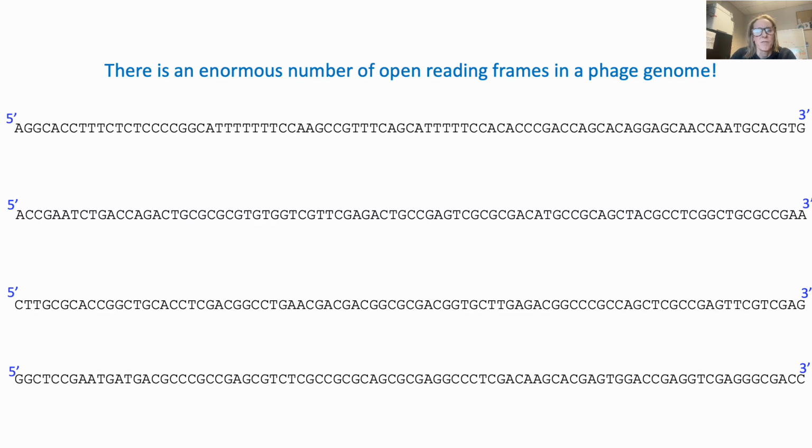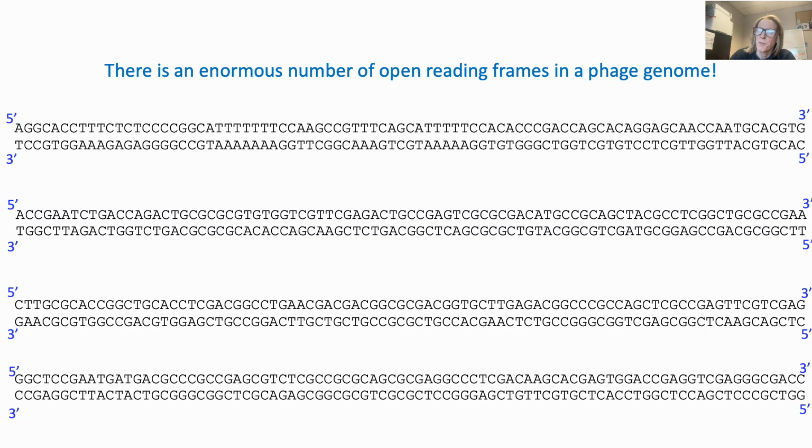Let's look at the beginning of the genome of phage Clipper. The FASTA sequence begins at the left arm of the genome, and it is the strand that reads 5' to 3'. The genome, of course, is a double-stranded molecule, and therefore there is also a complementary strand that reads 3' to 5', that is not shown but can be deduced from the 5' to 3' strand.